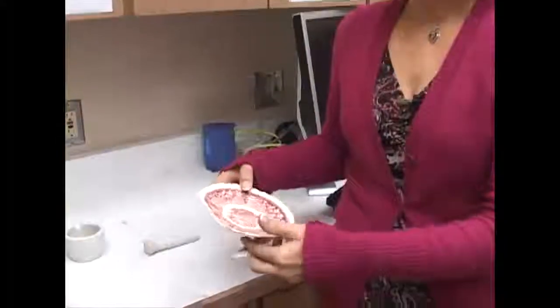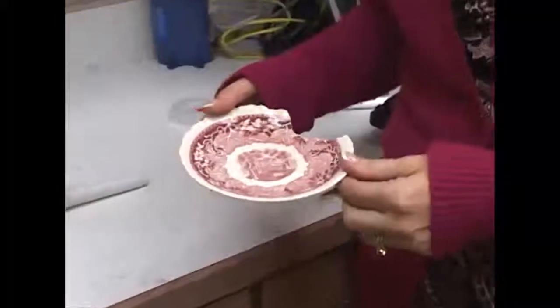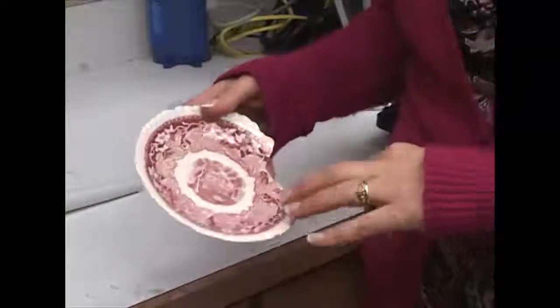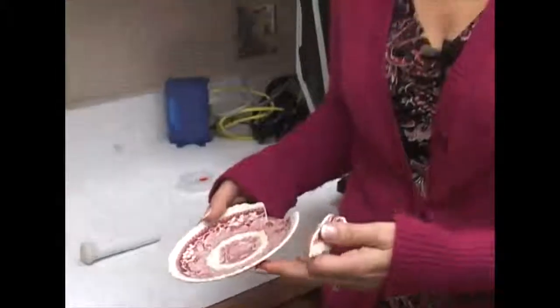A rather simple domestic application for x-ray diffraction would be something like this old plate. This plate was manufactured before the 1960s and it stands a good chance of having lead in it. I'd be 99% sure that the paint does have lead — but does it have lead or lead oxide? Is there a large amount of it? And should the person using this plate be concerned about its safety? We can find that out with x-ray diffraction.